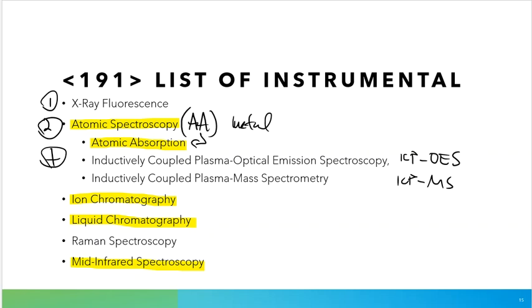All right. Next up, section number 3 is ion chromatography. We abbreviate this as an IC. And the ion chromatography can actually be used for both worlds of ions. So if you go back and take a look at some of those definitions, we said we could have cations, which are positively charged things, and we could have anions, which are negatively charged things. So ion chromatography can be adapted to do both. So we can separate and find positive things, and we can separate and find negative things.